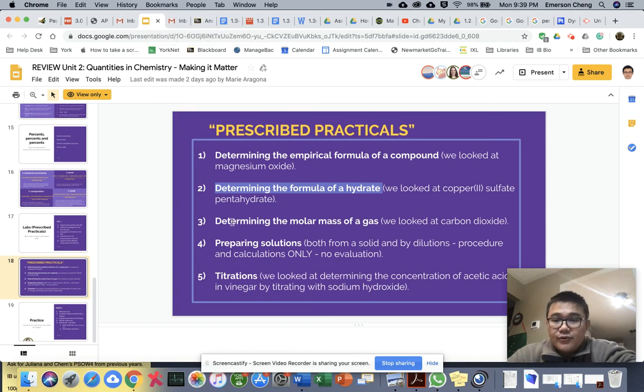So this is the third video of this series. We're going to be looking at determining the molar mass of a gas. This is one of the bigger labs that we have done that we didn't do a write-up on.